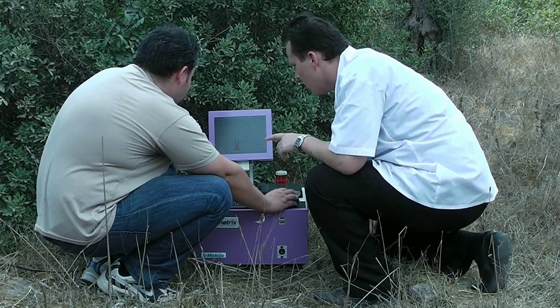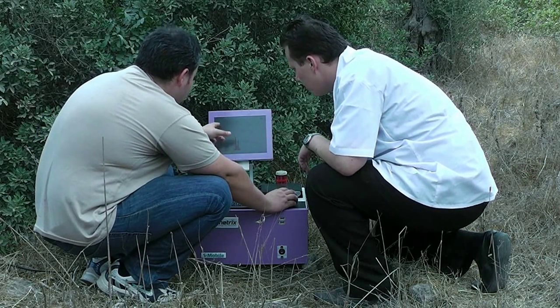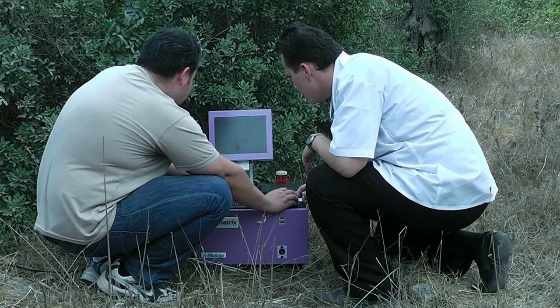Its unique ability for location-based data collection makes it the best for geologic, mining, exploration, and petroleum applications.